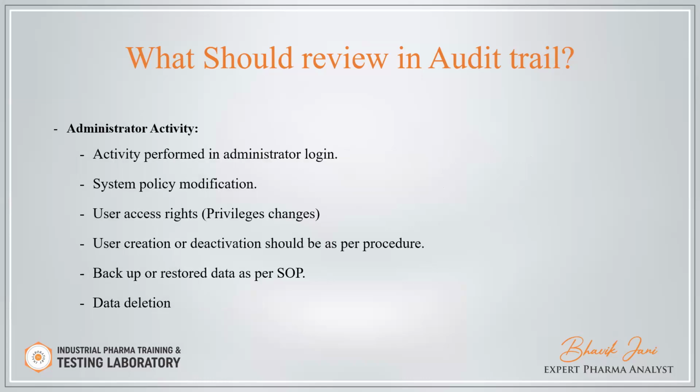Administrator activity: activity performed by the administrator login. Each and every activity performed by the administrator should be reviewed. System policy modification like user access rights, user creation or deactivation, backup or restore of the data, data deletion, all the points should be reviewed during the administrator activity review.